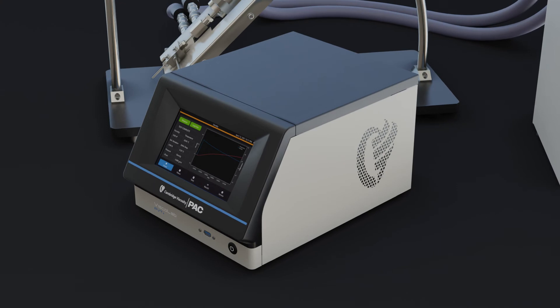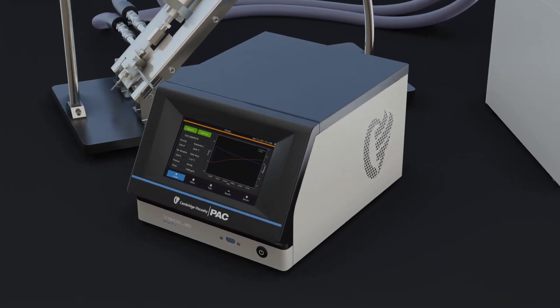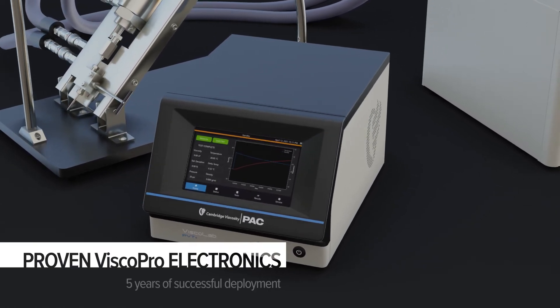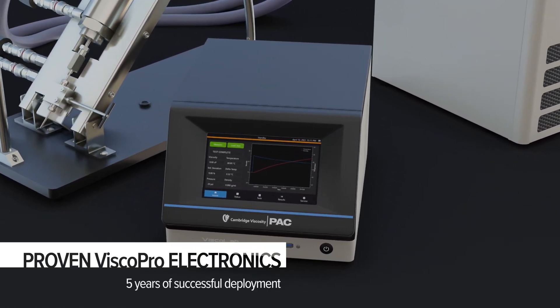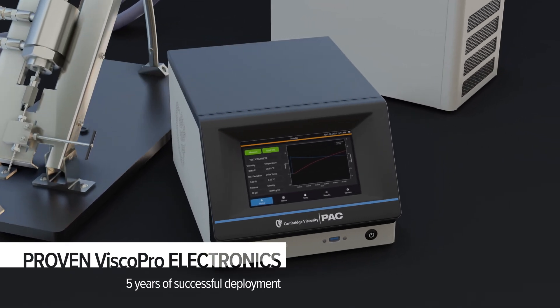The ViscoLab PVT Plus runs on the proven ViscoPro electronics, which has five years of successful deployment. With an onboard processor and a touchscreen, the PVT Plus delivers extraordinary ease of use and significant capabilities.